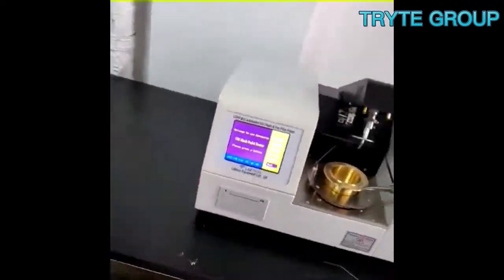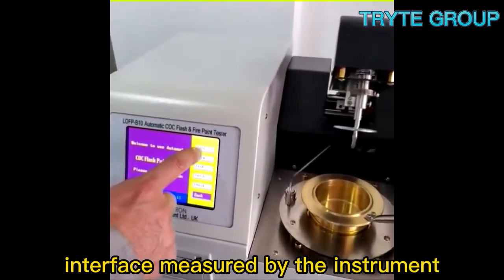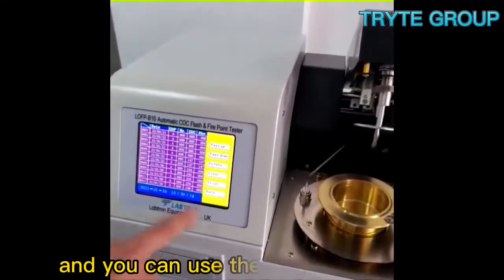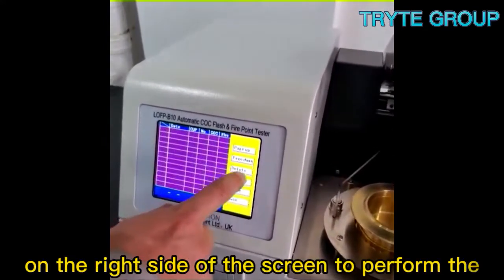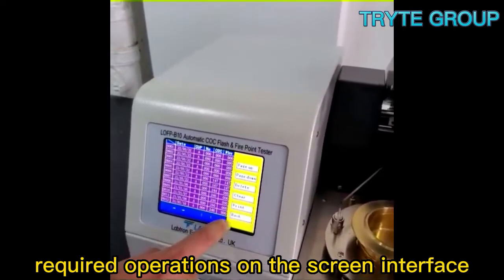Turn on the power button. The screen displays the historical data interface measured by the instrument, and you can use the operation buttons on the right side of the screen to perform the required operations on the screen interface.